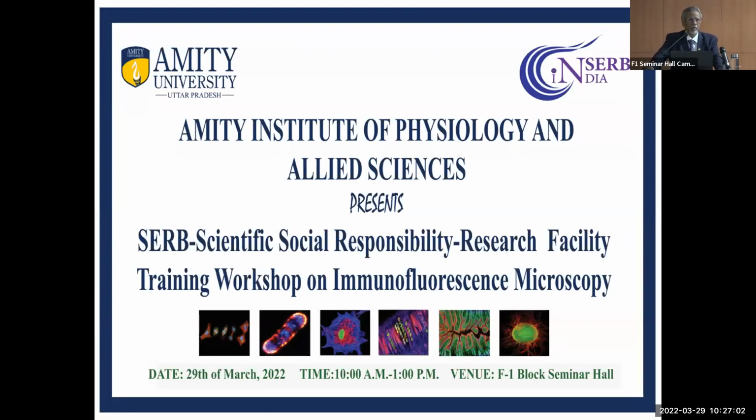There are n number of fluorescent dyes. It can be protein staining, it can be DNA staining. Mostly it is looking for a protein, detecting or utilizing the target antigen, because you detect immune molecules. That's why it is immunofluorescence: you fluoresce the immune molecules, mostly protein and antigen, using fluorescence-labeled specific antibodies. So you label through antibody-antigen reactions, and then you can detect where it is. That can be done in vitro as well as in vivo.